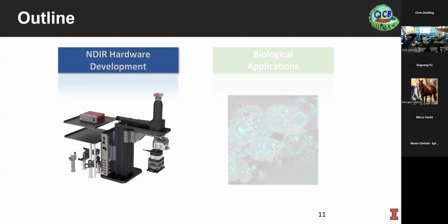Can you talk about what is the spatial resolution of your images? And what is ultimately limiting the spatial resolution? It's the electric field enhancement around the tip. So the tip's radius is something like 40 nanometers or so. So the tip determines the spatial resolution. Yeah, we're actively exploring that. We have a third major collaborator in this, Aniruddha, who is analyzing the resolution of the system with test targets, test polymer ramps, and edge measurements.